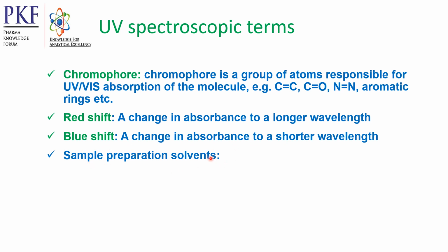Sample preparation solvent: generally those solvents are used for UV analysis that have no UV absorbance or low UV cutoff, like water, acetonitrile, methanol, ethanol, etc.